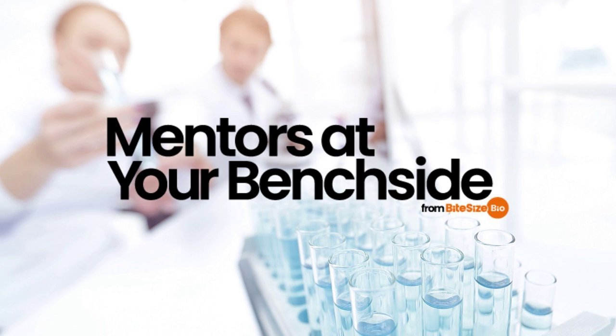Besides OD600 measurements, there are also other methods of monitoring bacterial culture growth and metabolism. Even though monitoring growth using a bacterial culture's OD600 is a tried and true method, there are several other ways to assess the growth and metabolism of bacterial cultures. You may find that some of these factors are more relevant or useful for your specific application too. One of these methods is imaging.